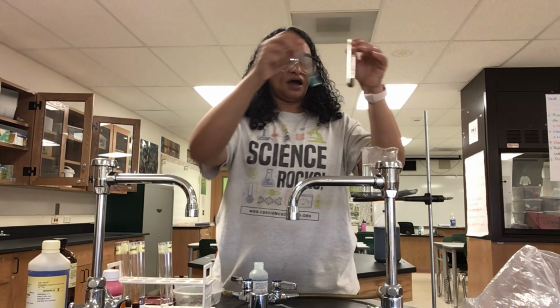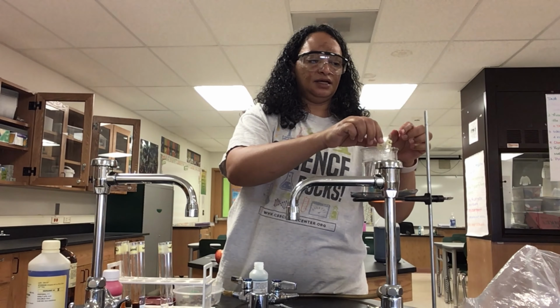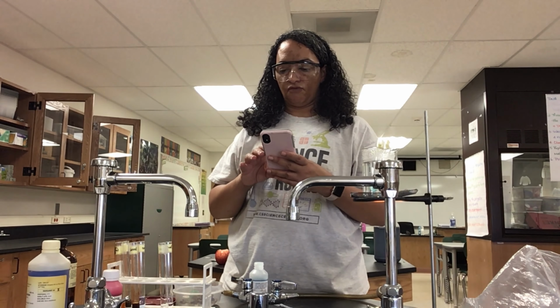Alright, so now these guys are going to go into the boiling water for 3 minutes. And that should boil here any second. And let me find my phone and set the timer for 3 minutes.